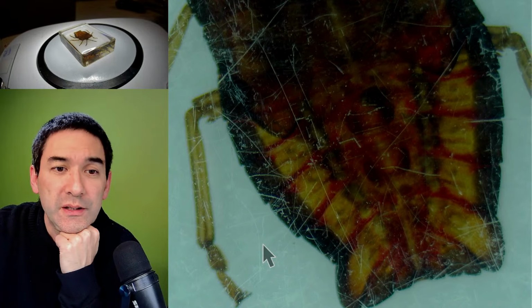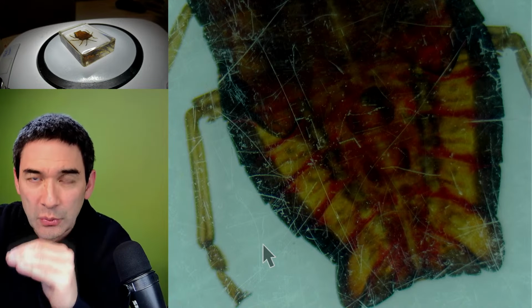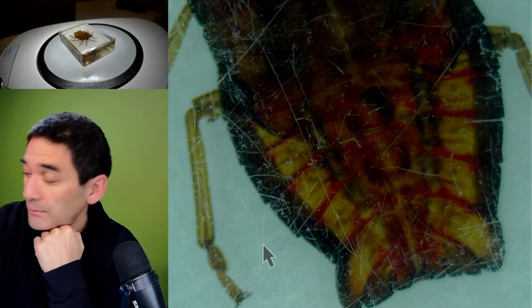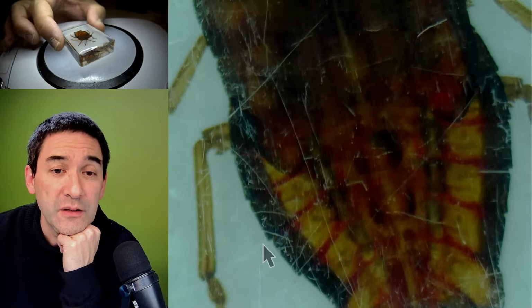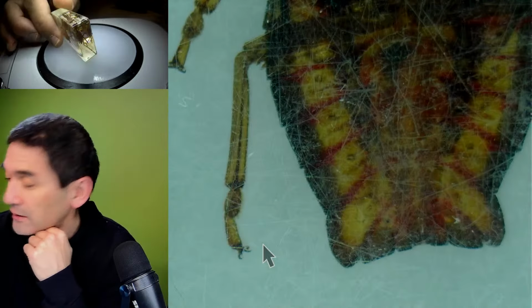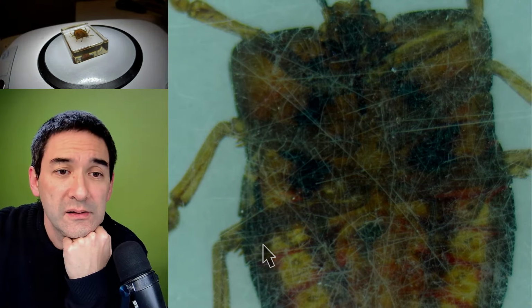And just to make sure that there is a completely flat surface, I might also have to glue a microscope slide on top, because of course glass is significantly harder and does not scratch. Let's see. Other way around here, yeah, the legs.